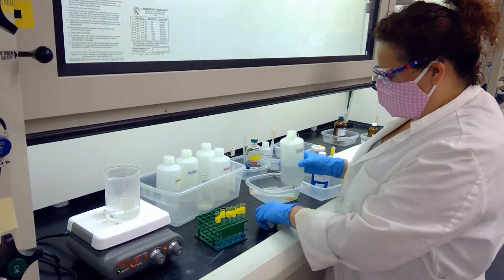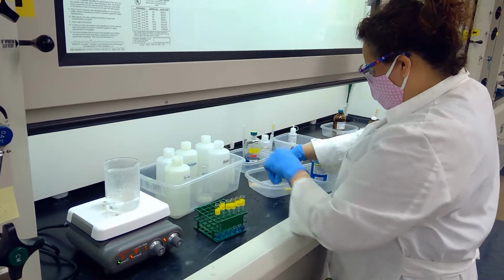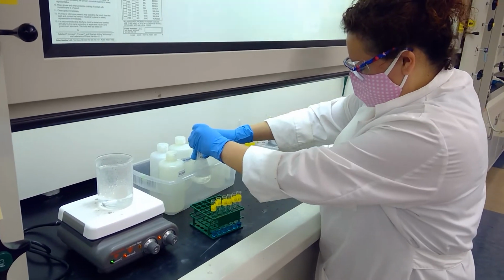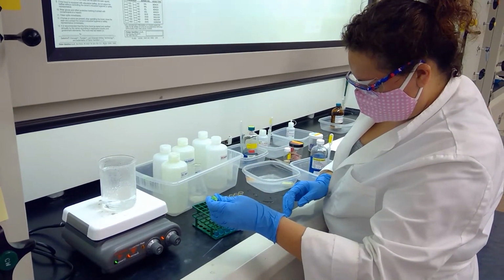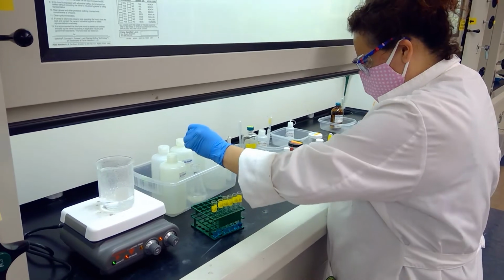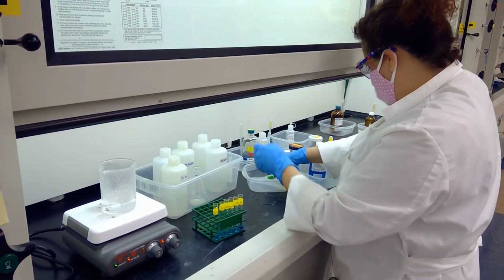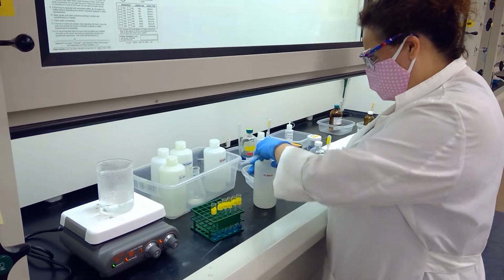Okay, water is going to be our blank. Water is not a carbohydrate, so we should see no change happening there. Let me go ahead and make sure I'm using the correct pipette for every sample. Okay, so that's for sucrose. Okay. Next up, we have starch. Alrighty. Oh, my starch one is right here. Here's starch.